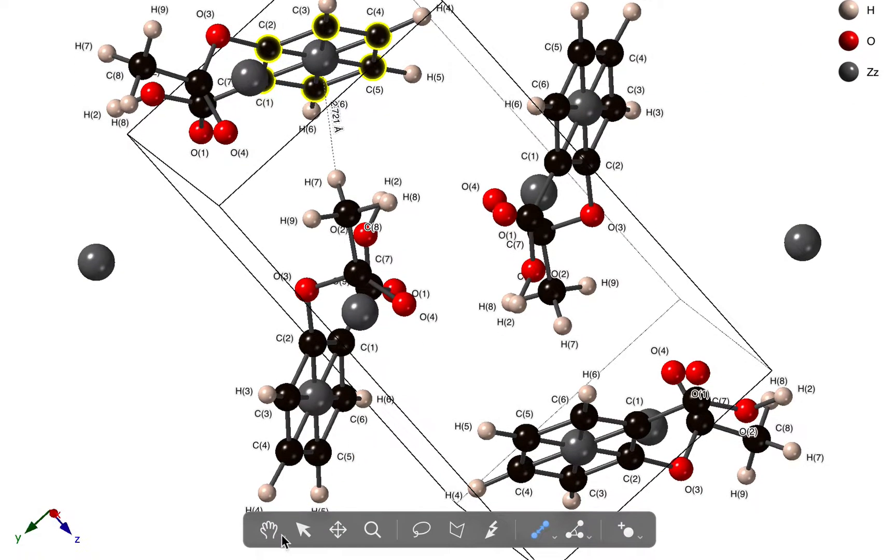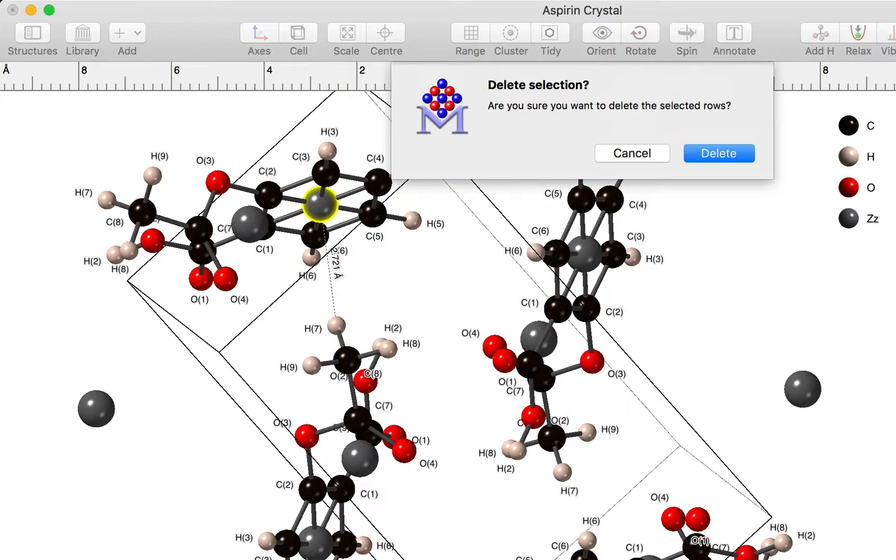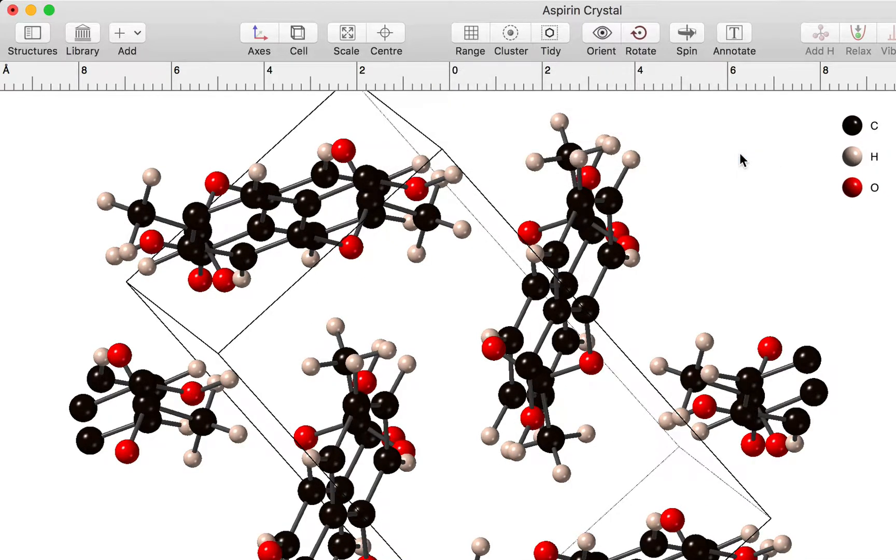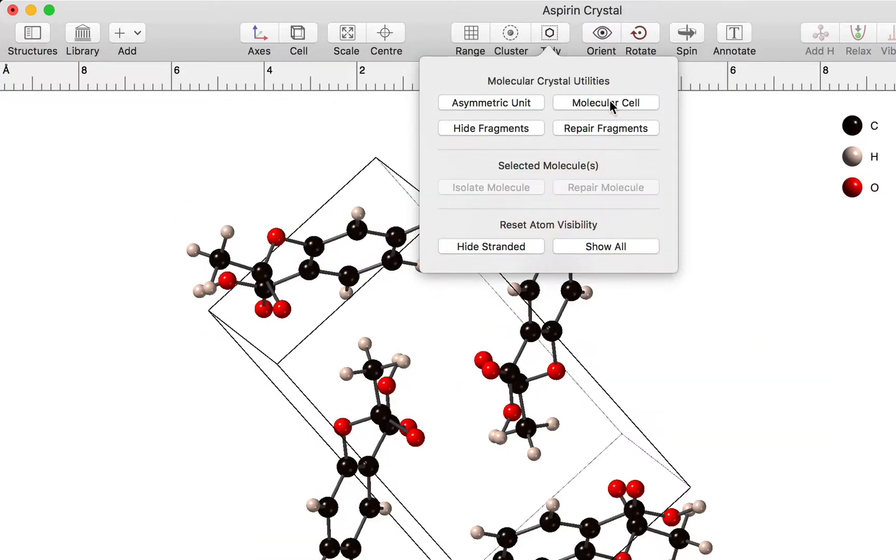I can do this in various ways. I can go down to the arrow tool and select the atom and delete it, or I can go to the atoms inspector, select the row containing the atom and press the delete key. I'm going to go back to the tidy command and go back to the molecular cell now.